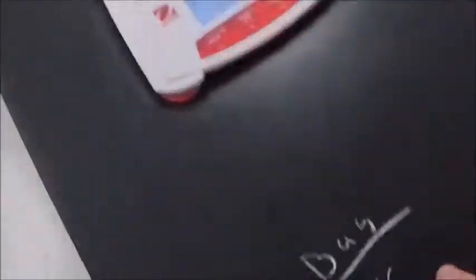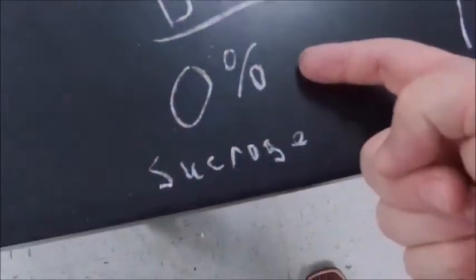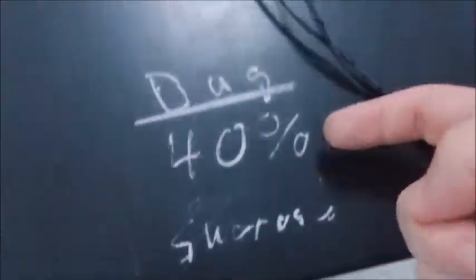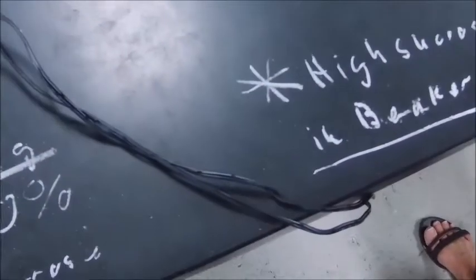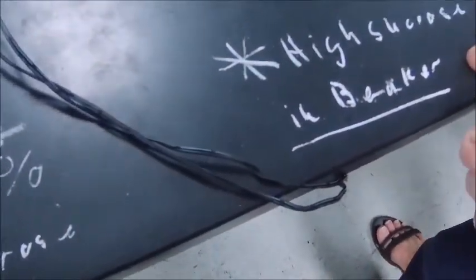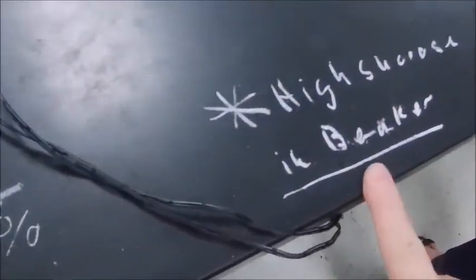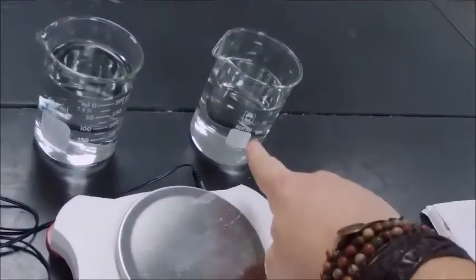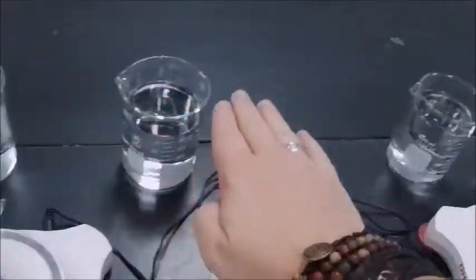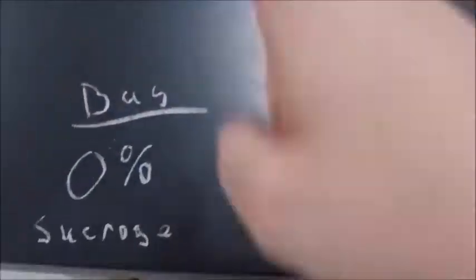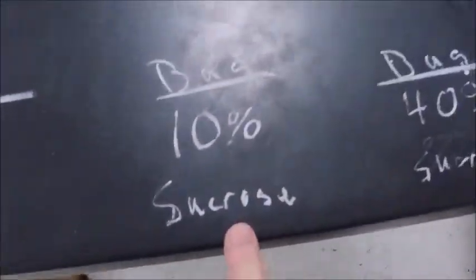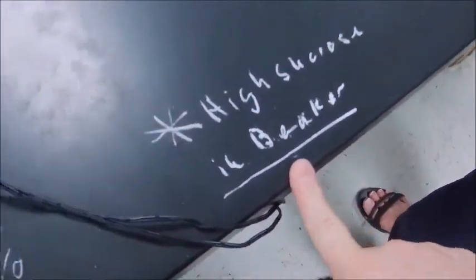Here is the bag setup for the osmosis experiment. We have a bag with 0% sucrose (water), a bag with 10% sucrose, a bag with 40% sucrose, and a special fourth setup not in the lab manual: a water bag placed into a beaker containing a very high concentration of sucrose. So the beakers contain water, water, water, and super-high sucrose — and the bags contain no sucrose, 10% sucrose, 40% sucrose, and water respectively.